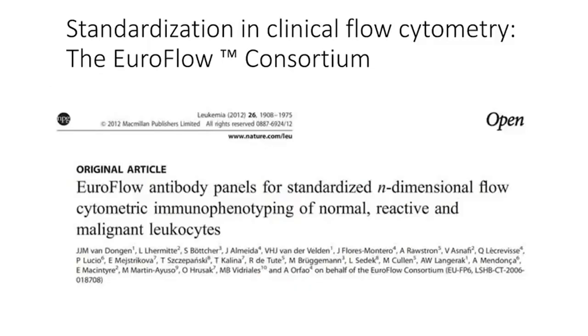So the notion of standardization in clinical flow cytometry is relatively recent. Traditionally, labs have developed their own antibody combinations, and so in everyone's lab, things looked a little bit different.